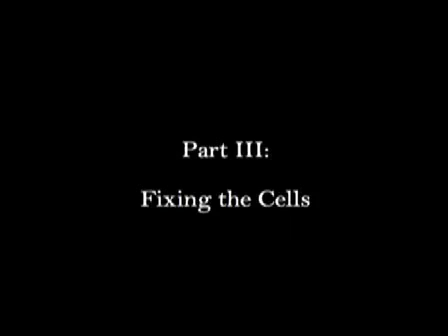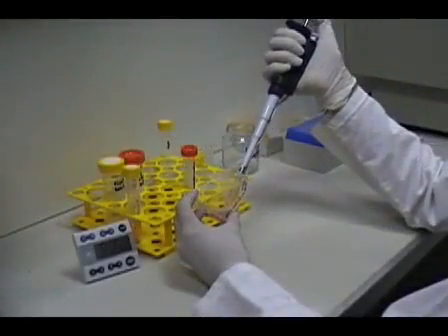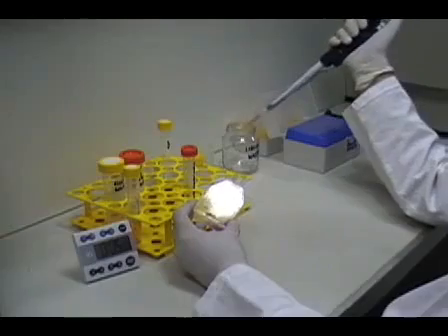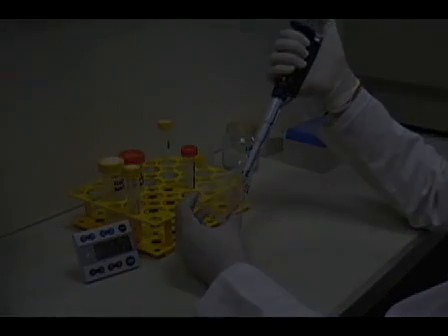Fixing the cells. After the incubation period, the cells are now ready to be fixed. At this point, it's not necessary to work under sterile conditions.